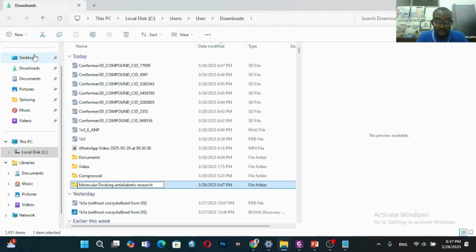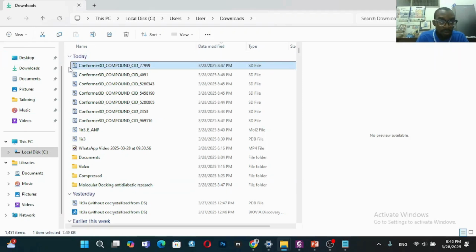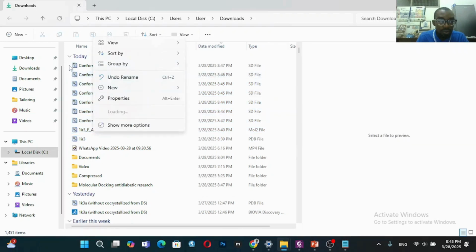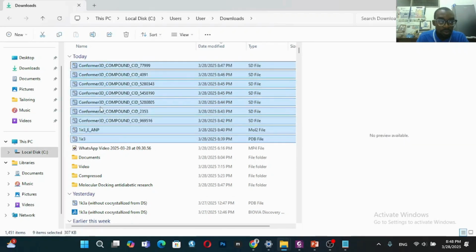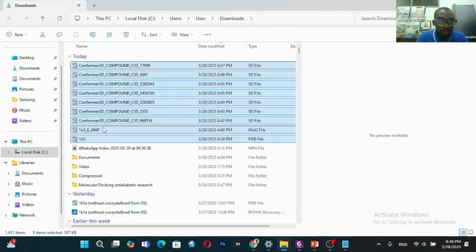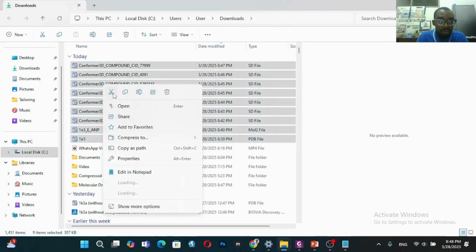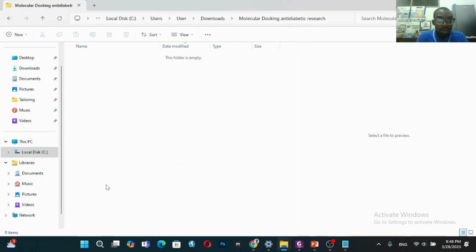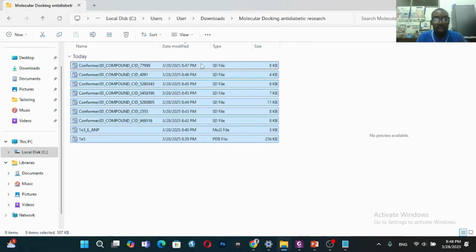Now you can choose to name it whatever you wish. So let's copy everything there. Oh, sorry. Okay, good. So we have everything in this folder.